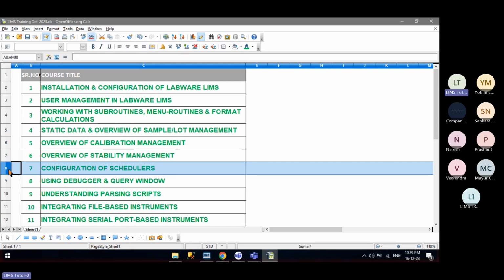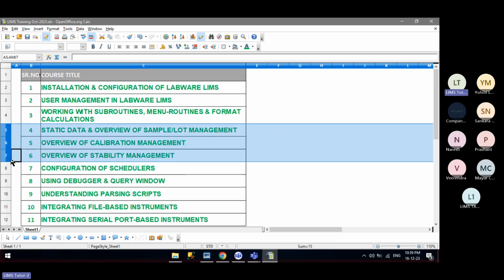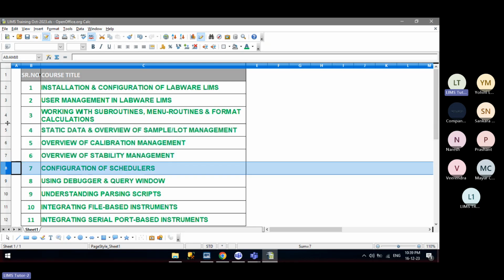So understanding these technicals will help you to continue with your activity more. That will give you an added advantage. It will help you to do your existing task perfectly if you are aware of how the technicals are configured.